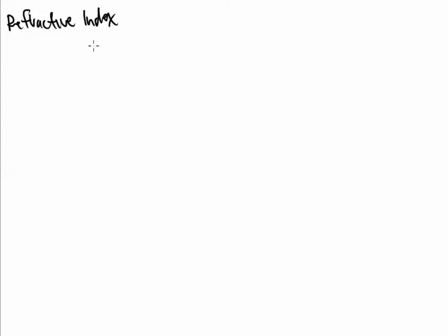So let's talk a little bit about the theory of refractive index before we talk about how to measure the refractive index. Okay, so what happens is that you have to imagine a surface. And here's the surface. Now this surface is going to be made of a prism. Now we've all seen prisms before, right? We can shoot light into a prism, and if we've got the right type of prism, the prism will divide the light up into all of the colors of Roy G. Biv: red, orange, yellow, green, blue, indigo, and violet. All right, well, we've seen refractive index at work.